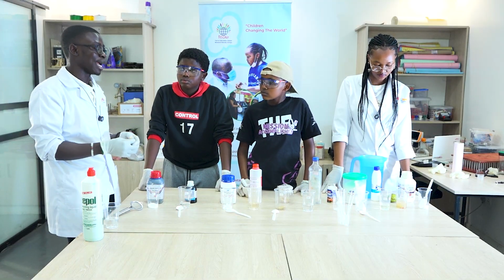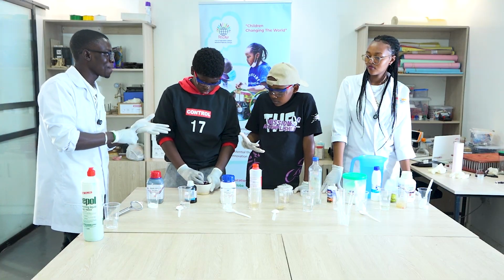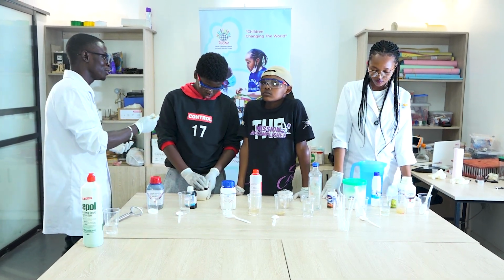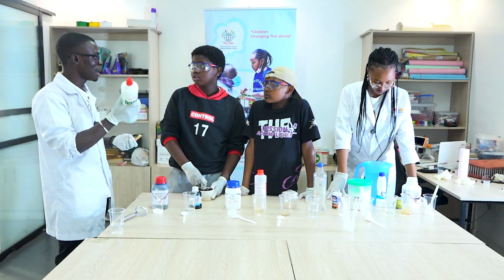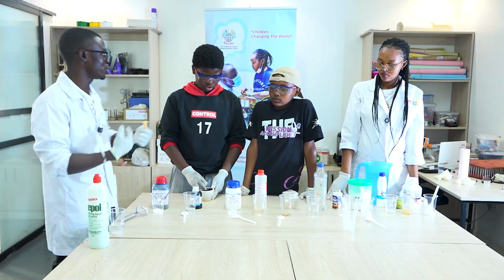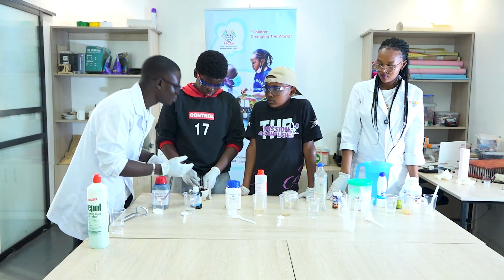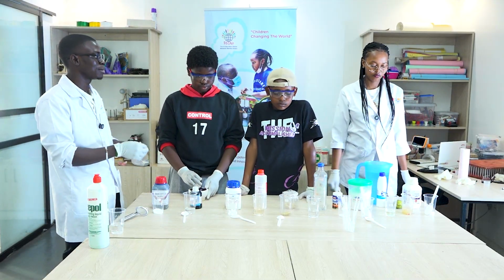One thing we know with acids is some are corrosive, some are irritants. So let's take caution so that we don't touch them directly. And one thing we know with bases is an example of a base is like a soap. So these are mild. Some are corrosive, some are mild. For example, we have one here like sodium hydroxide, which is not so good. And some don't smell so nice, so we just take caution so that we don't smell them directly. You can waft from a distance, okay? And some we are just going to smell from a distance.